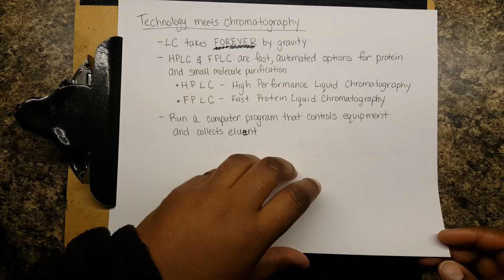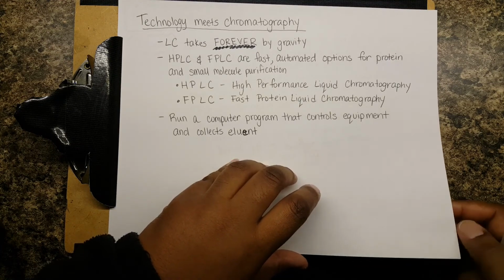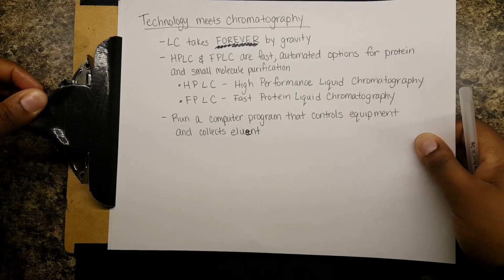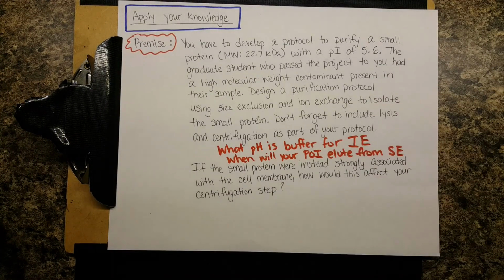So if you are thinking about grad school and doing anything with protein purification, make sure your lab has an FPLC or you have access to one, or else it's going to be struggle bus. Okay.